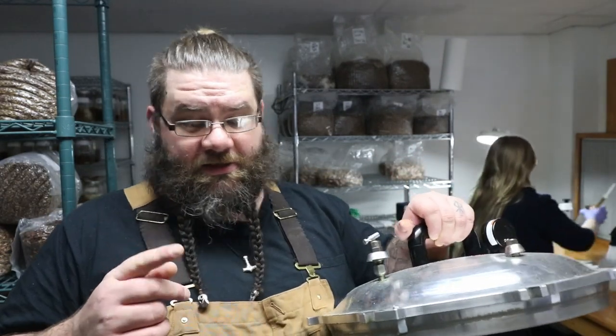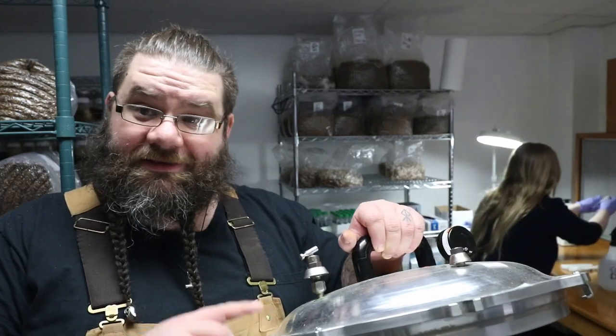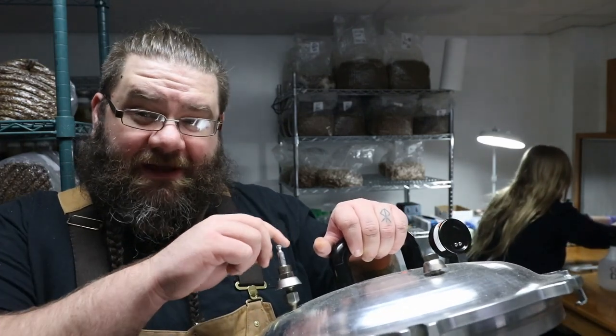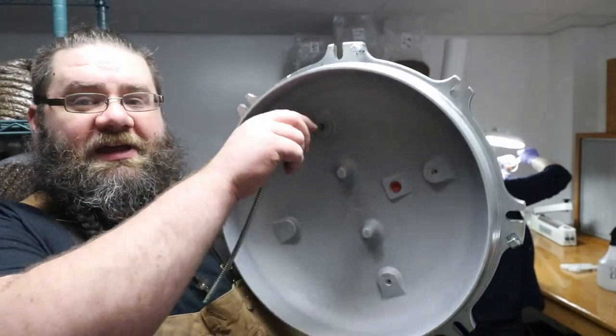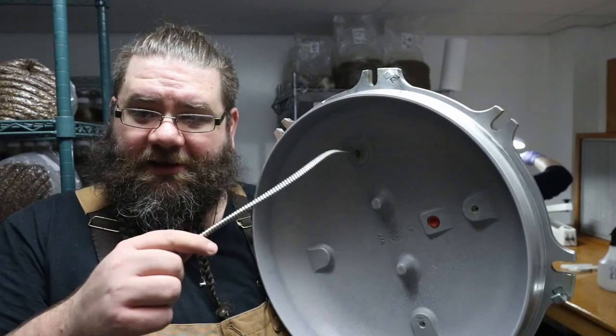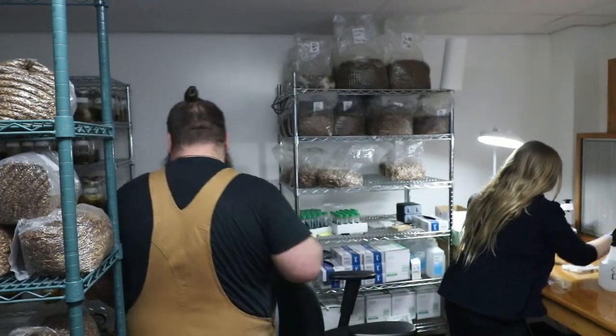Interesting little tidbit, by the way. You can buy the All-American canners and then buy the stopcocks, and what that will allow you to do is just swap it out. So right now there's apparently been a big shortage on the sterilizers. Just buy the pressure canners, like another $30 or so, buy the stopcock, and swap them out. You can always turn this thing back to a canner if you want, or you can turn it into the sterilizer. It does help to make sure that the hose comes with it. But yeah, that's what I have found to be the best way to get a sterilizer right now.